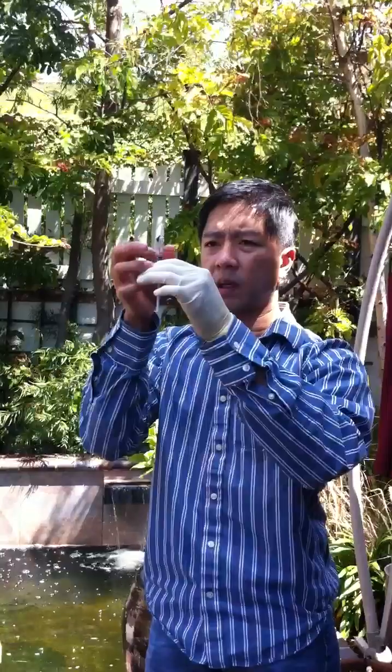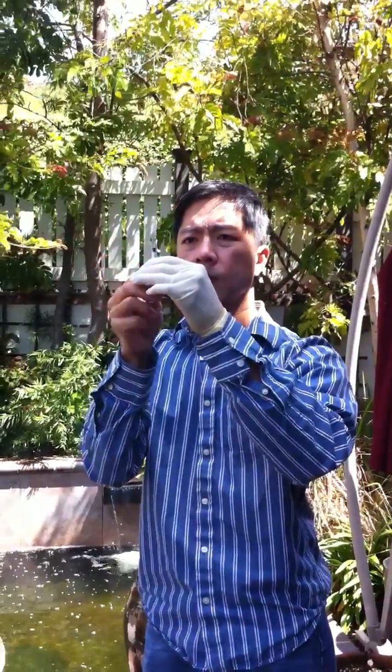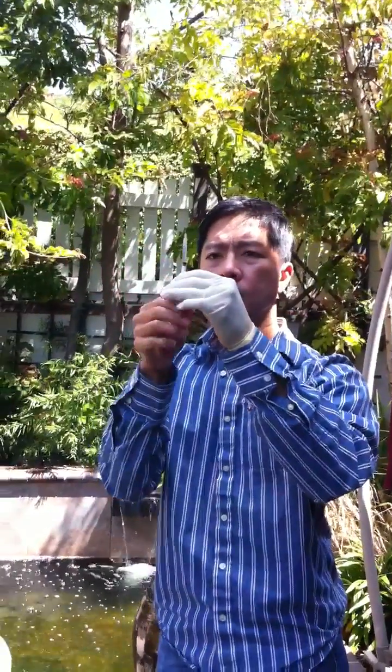You want to get all the air bubbles out of this. I usually take about 0.1 milliliter more than necessary and then just push it up to get rid of the air bubble. I'm going to draw a little bit more because there are still air bubbles in here.